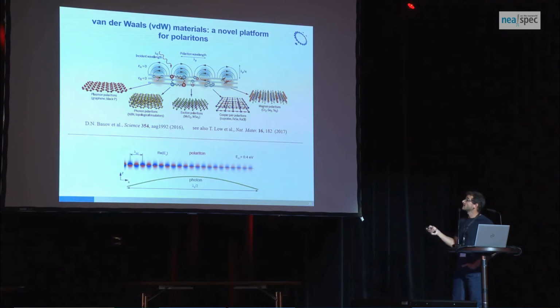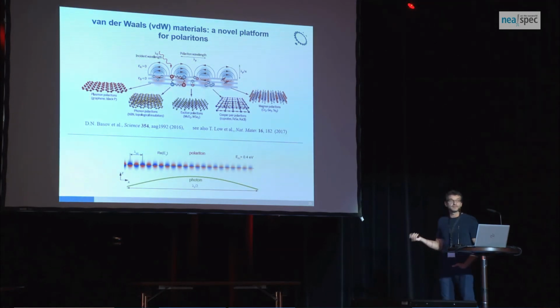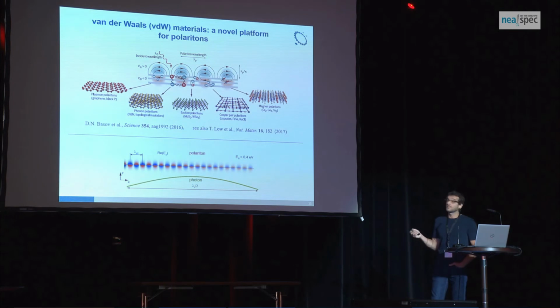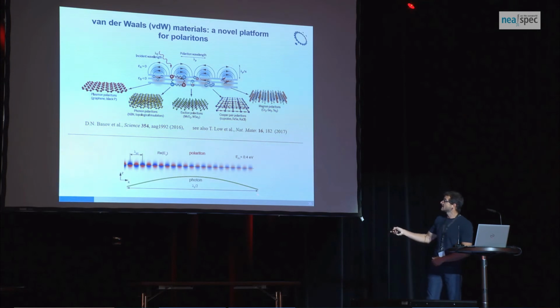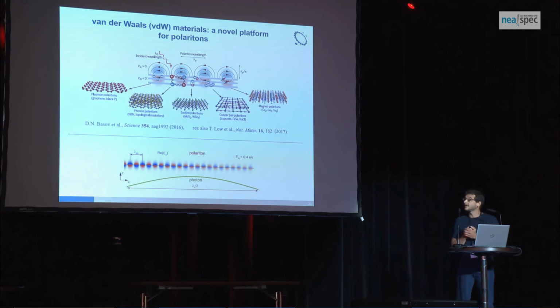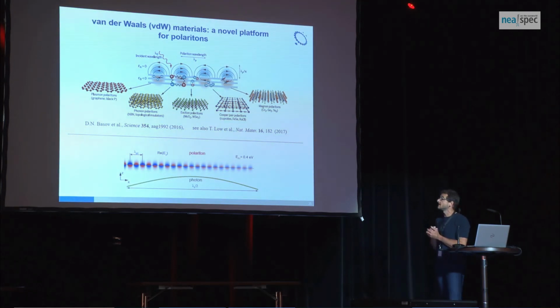So what is it? A polariton is an electromagnetic wave that is formed by coupling of photons of light with dipolar excitations in the material, for example, with charge carriers or plasmons. And in this case, an electromagnetic wave is formed that is called a plasmon polariton. The fascinating thing about that in 2D materials is that these polaritons have an extremely short wavelength and extremely large field confinement. Here, that's schematically shown: half the photon wavelength, and that's the wavelength of these polaritons. That makes it interesting for future nanophotonics circuitry or for sensing applications, for many things. That's why people are interested in imaging them.